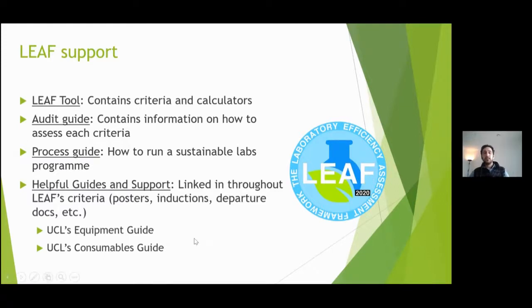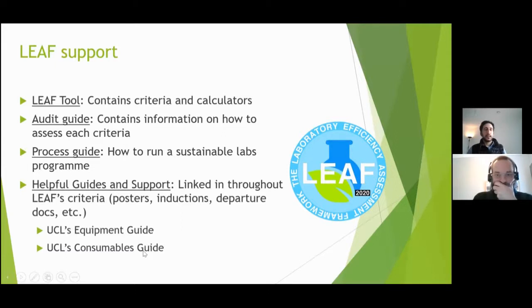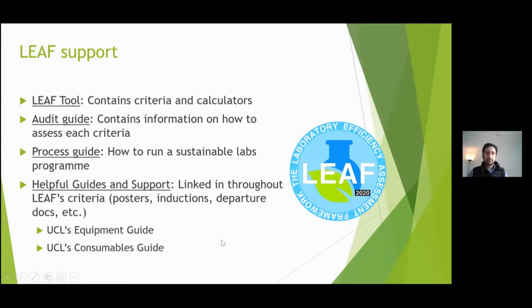What I did want to say is that if you take nothing else away from here today, we've put a lot of these resources online anyways. We have a process guide that we're about to put up, which is how to initiate a Sustainable Labs program. But we also have an equipment guide and a consumables guide. Those are really focused on providing you the technical know-how, for example, on the debate about glass versus plastics, which is better. By the way, reuse is always better in case you're unsure. So the reuse of plastic, reuse of glass is better. We have these guides and we're going to update them annually, and that is where we would put the technical advice. So I won't go through any of the technical stuff today, but I would encourage you to have a look at those. And if you see something's missing, please do let us know, and we'll add you as an author.